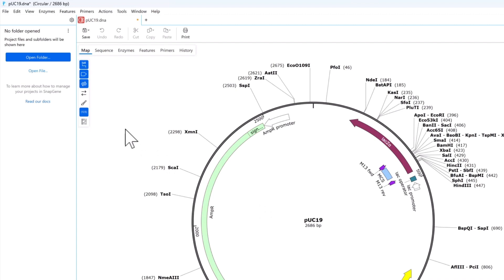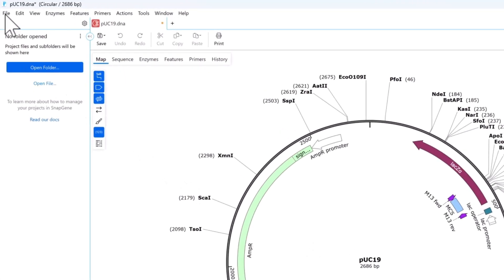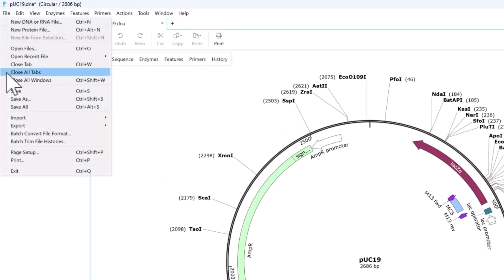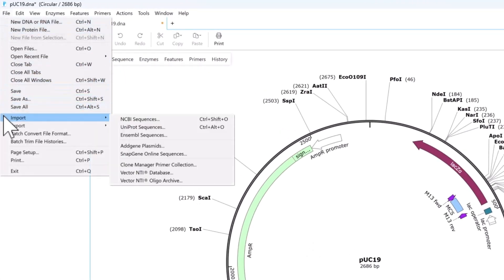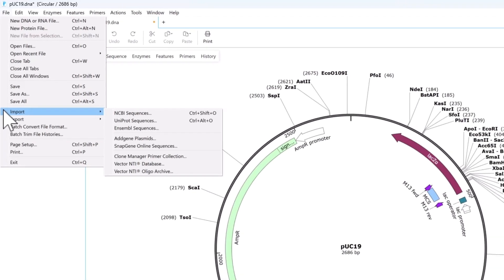Alternatively, select File to do these tasks from the main SnapGene interface. This includes importing adgene plasmid sequences or any published sequence from NCBI, Uniprot, or Ensemble using the appropriate accession number.